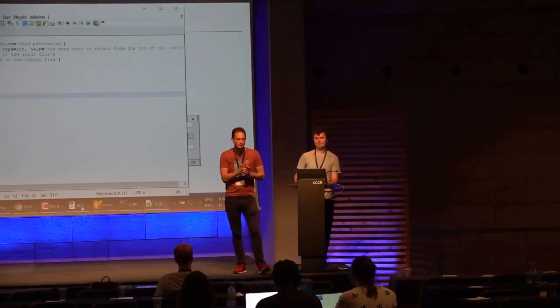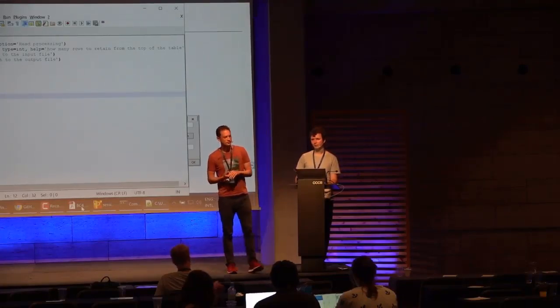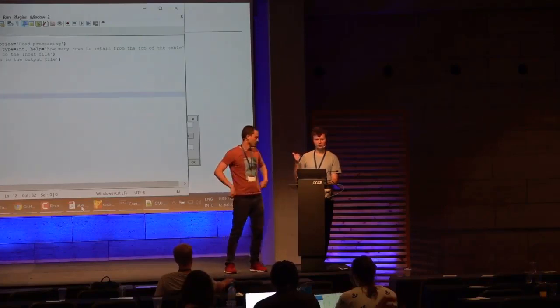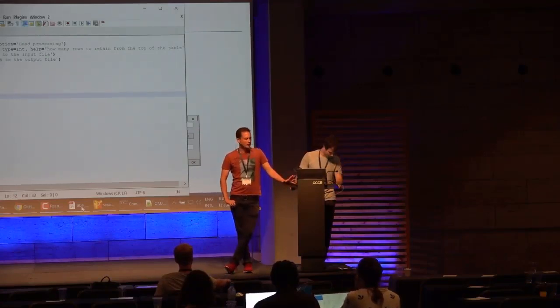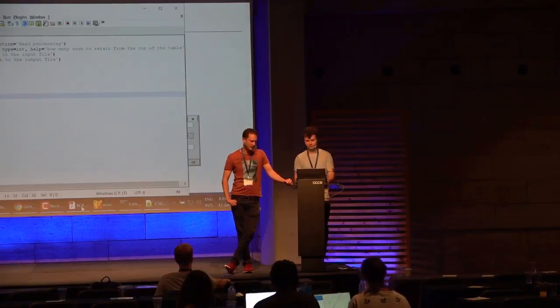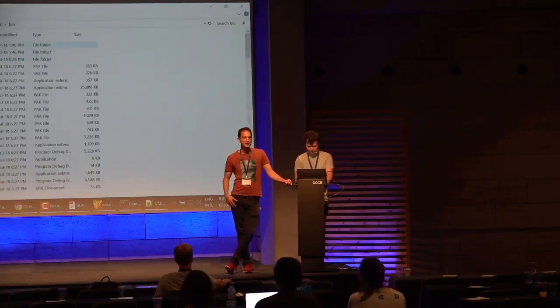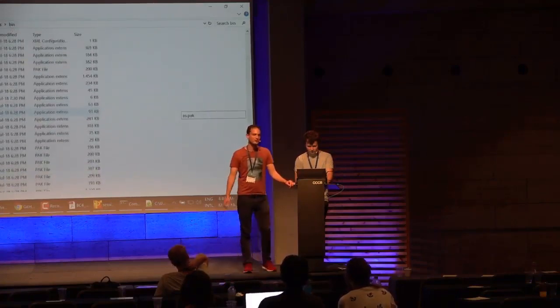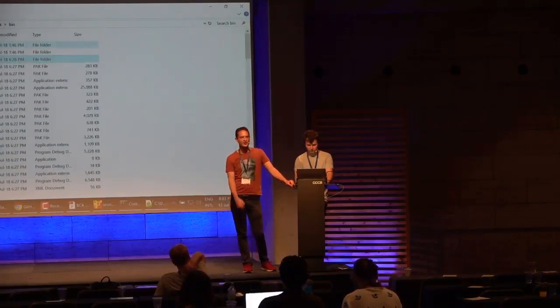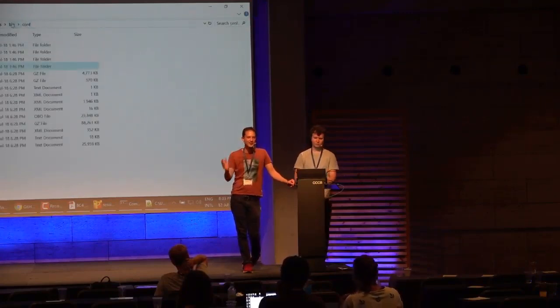Maybe another thing, have you thought about doing a log file for making your life easier for bug fixing? In general, not of the plugins. Perseus in general, yeah. That's just a fun fact from the development version: when we run it inside of Visual Studio, we actually see a lot of the debug output. But for now, we want to keep things simple, so we don't spam you with the log output, because we get people complaining, for example, when they have Perseus in Dropbox and it keeps notifying them that something changed.